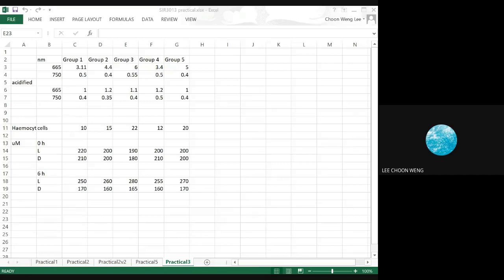What's the small v, what's the large V? The small v is the volume of the acetone. In this case, it is 8 ml. The large V is the volume of the seawater filtered, from practical 1. The volume filtered is 500 ml.